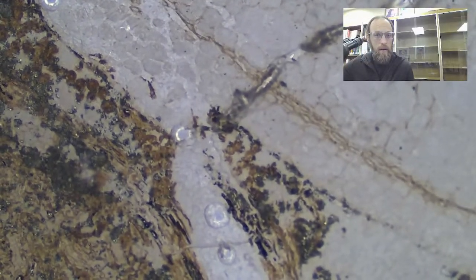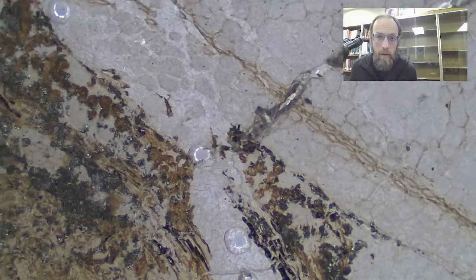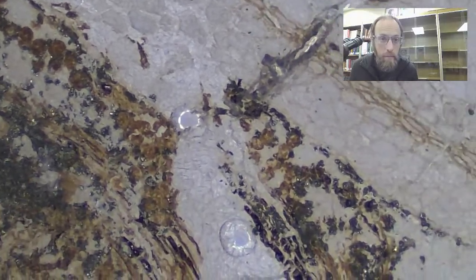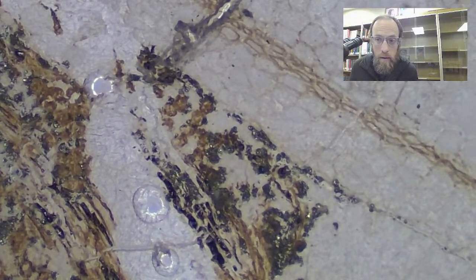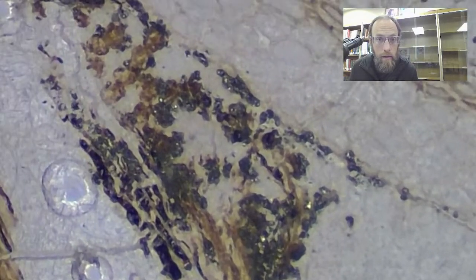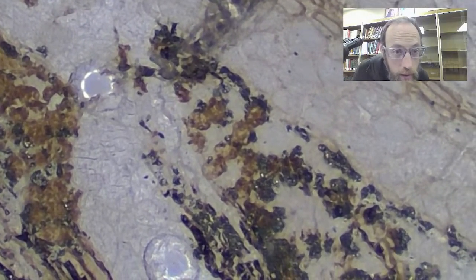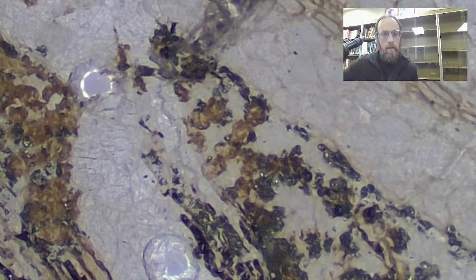So I'm going to get that nice and focused up. Actually make it bigger. It's awesome how big you can make things on this. Yeah, there we go. Yeah, what do we got going on there?